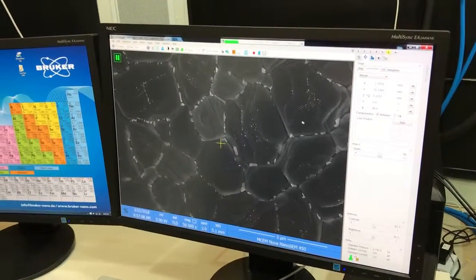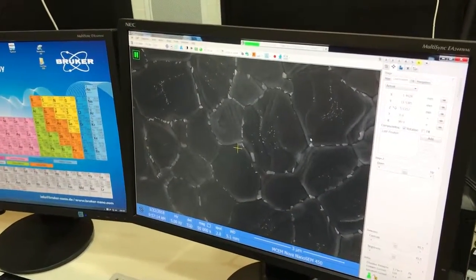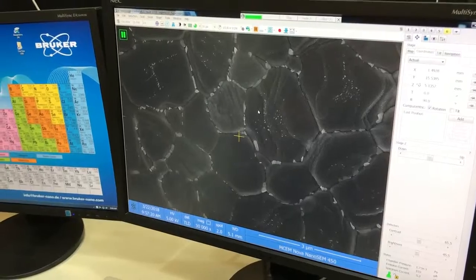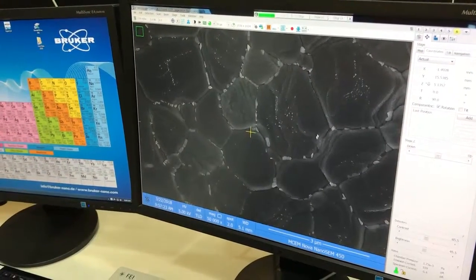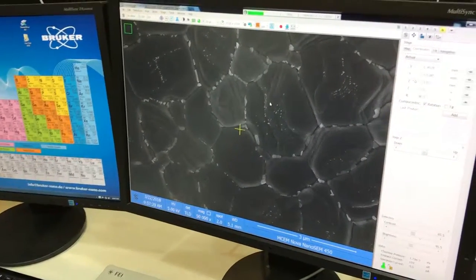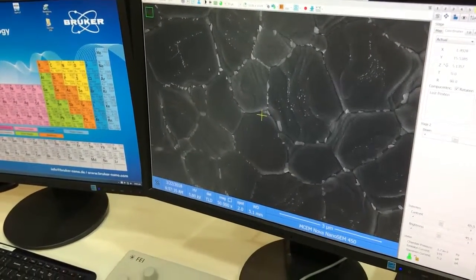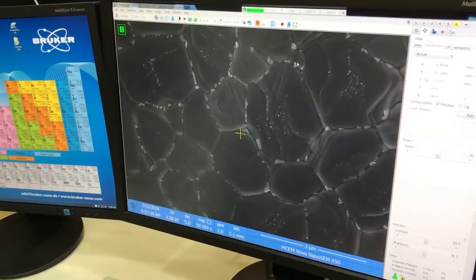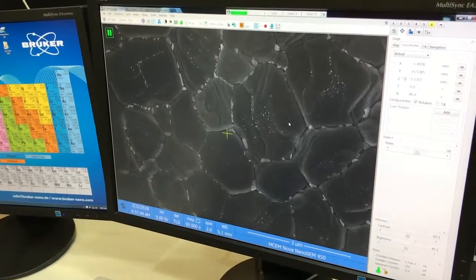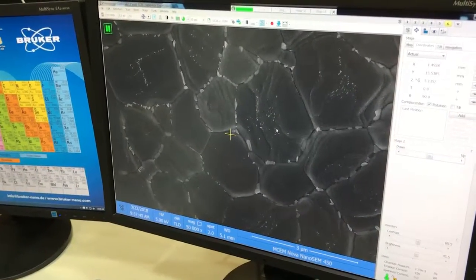Wow. Can you explain to us a little bit about this image, Wen Liang, about what you see in your specimen? Yeah, so the sample that we're working on is a perovskite polycrystalline thin film. Essentially, these are the perovskite grains, and each grain is one perovskite grain. Each grain we can think of as a single crystal, but they sit next to each other, so we call it polycrystalline. So each individual grain is essentially one crystal? Yeah, that's right. Okay, great.